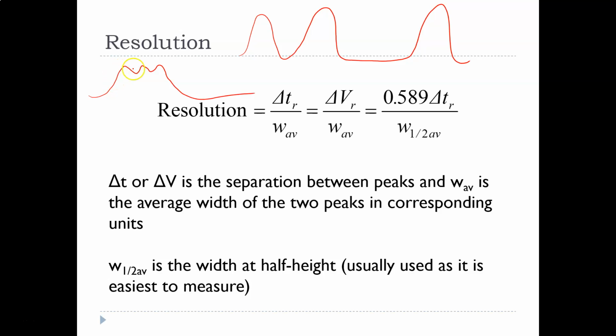Because sure, it's like, okay, well, there's 3 bumps, but which peak is which, and they overlap, and so how much, like it just, that's not good. So we want strong resolution, which means separation between peaks. This is bad. This is good. By the end of this, we're going to be calculating the area. We won't be calculating, but with chromatography, calculating the area under the curve is really important. And so if you don't have distinct peaks, calculating the area under the curve is not helpful.